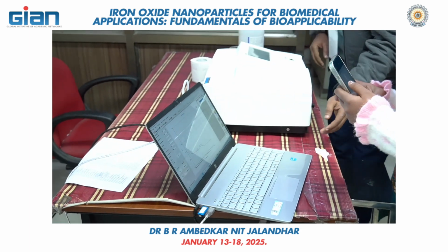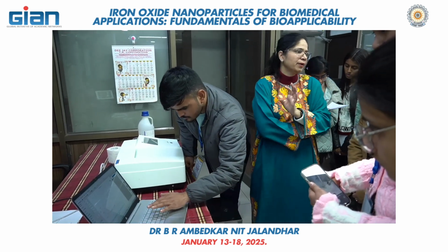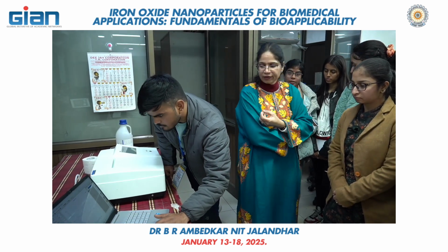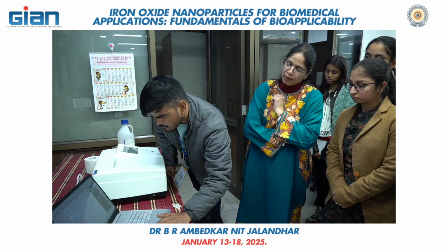So 516, I have told you 520 nanometer. So this is approximately the same, 516 nanometer. Now you can see this broad band is there.